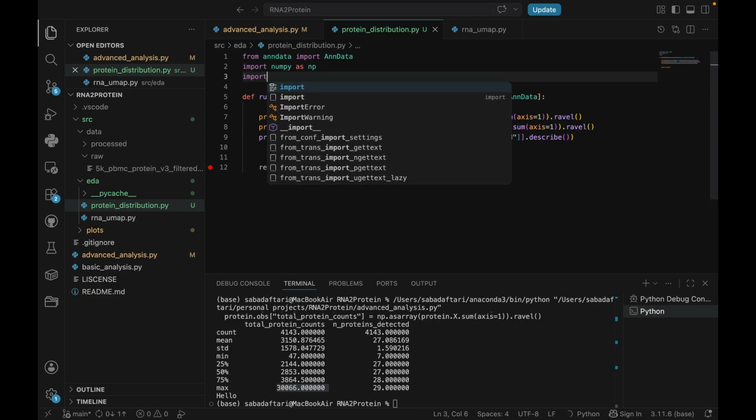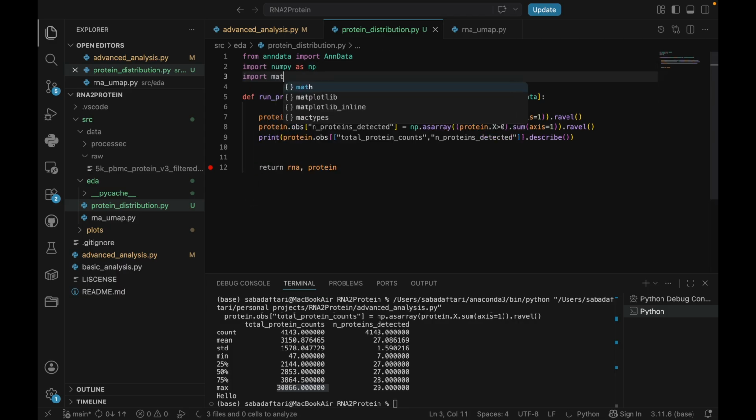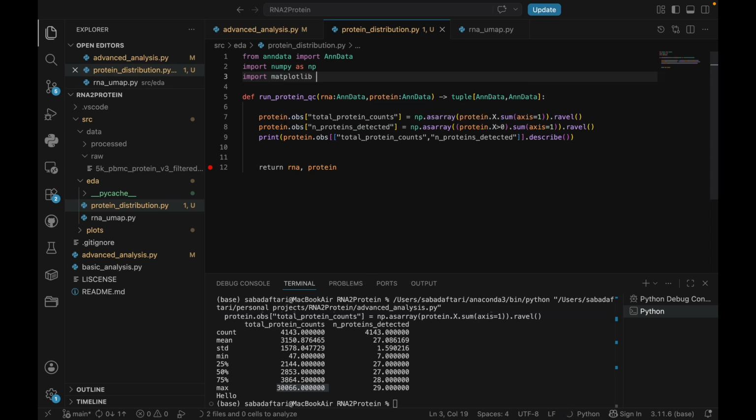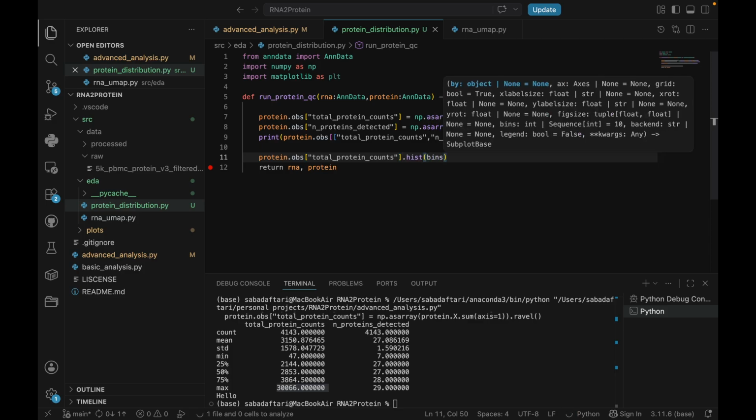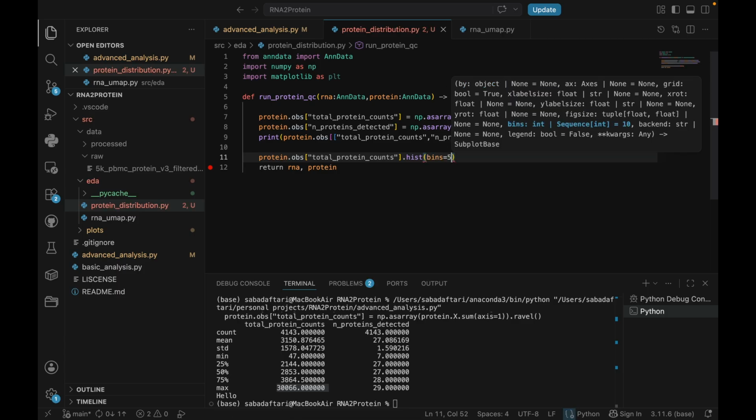I'm going to go protein obs total protein counts dot hist, bins, let's say 50.